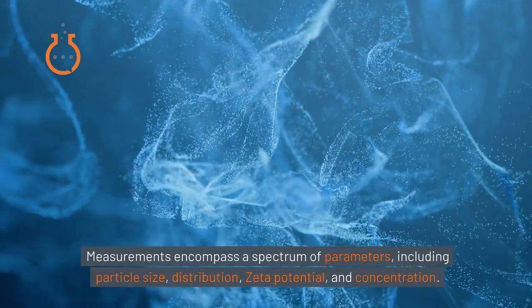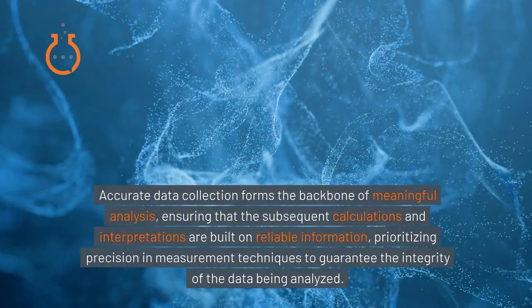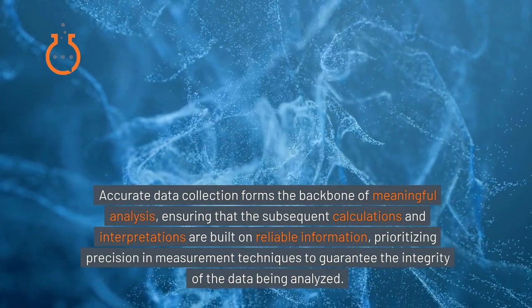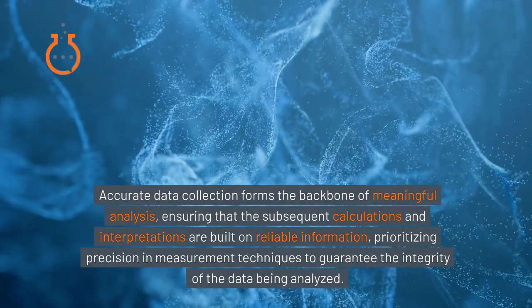Measurements encompass a spectrum of parameters, including particle size, distribution, zeta potential, and concentration. Accurate data collection forms the backbone of meaningful analysis, ensuring that the subsequent calculations and interpretations are built on reliable information, prioritizing precision in measurement techniques to guarantee the integrity of the data being analyzed.